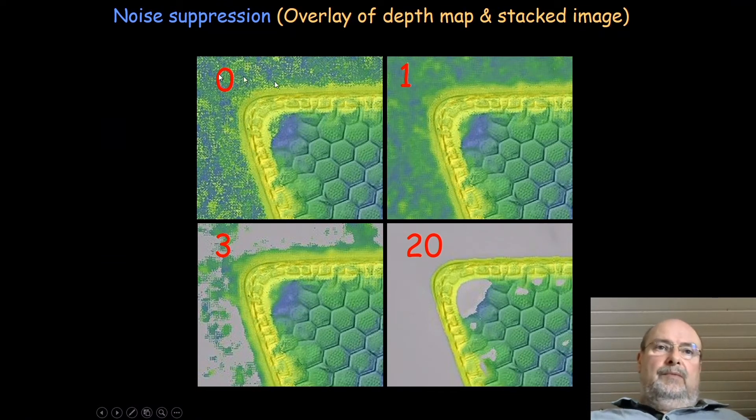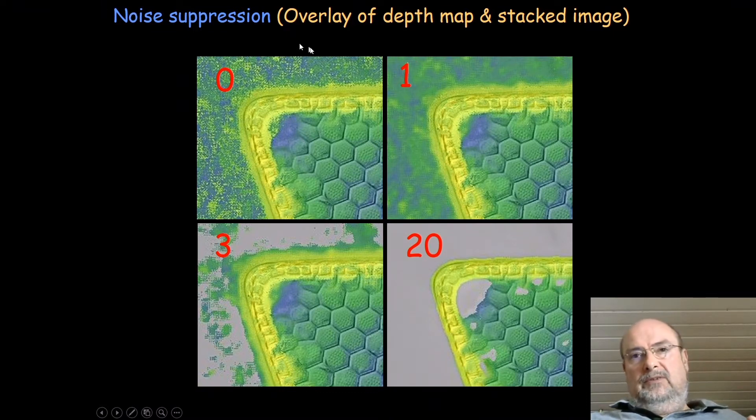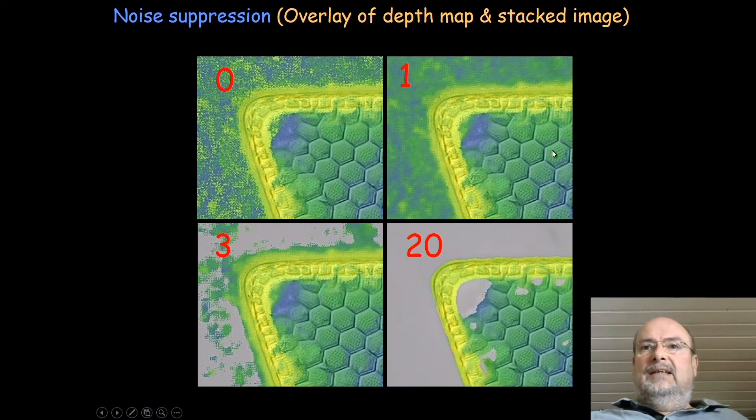At a value of 0, there's structure recognized everywhere and this is only noise you can see here. At a value of 1, it's still structure seen but the noise has been reduced, so 1 is almost good to have at minimum for noise suppression. It gives smoother results and doesn't change anything in areas where real structures are. Then I tried a value of 3 and you see grey areas coming up where nothing is seen anymore. Actually 3 is not enough. 4, 5, 6, 7 might be better. And 20, which I tried here, is definitely too much because we have loss of information about structures in our object.